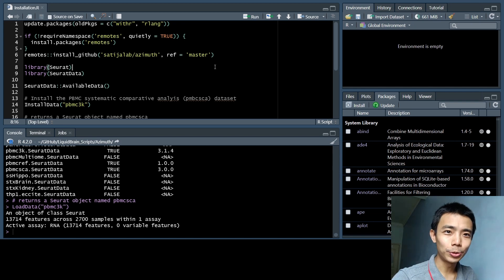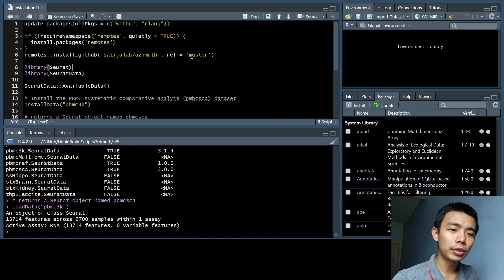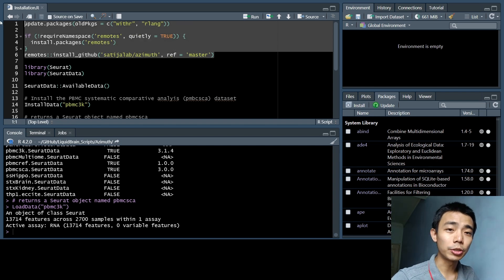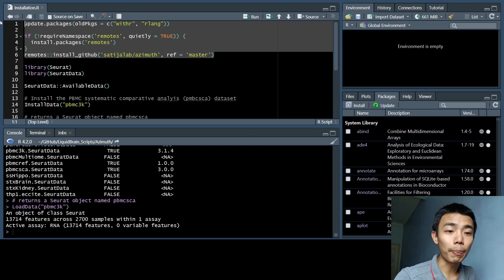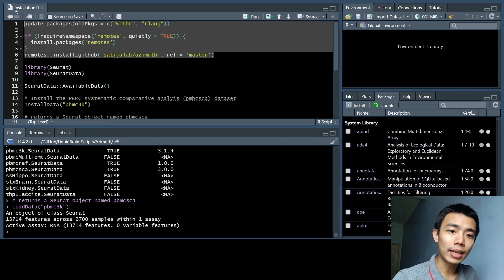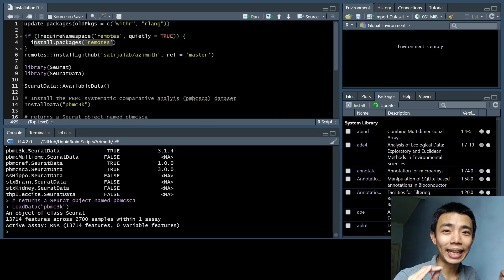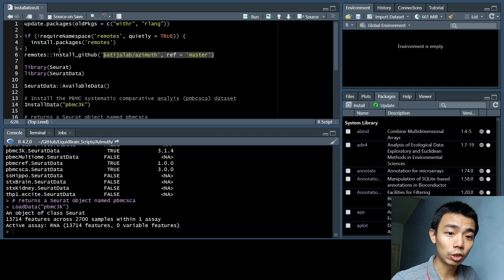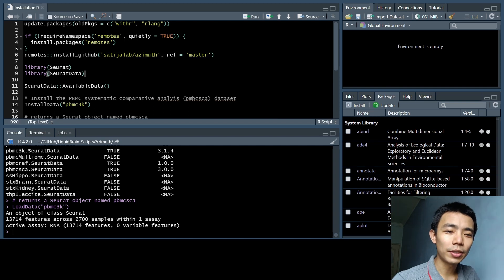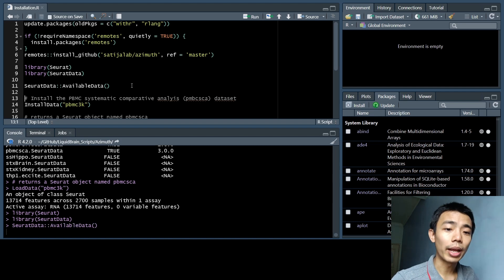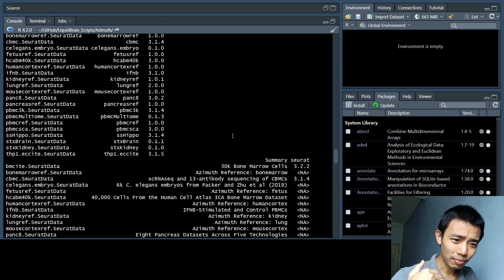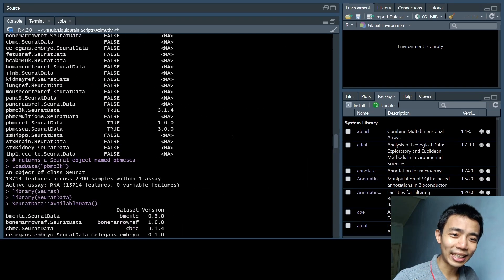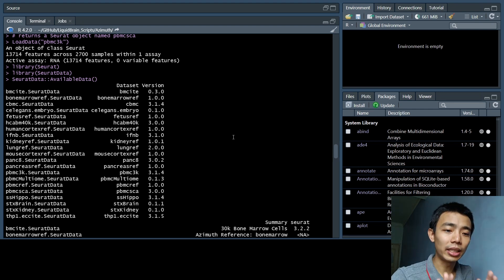Once you've done that, I also include a short script for you to install Azimuth as well as how you actually create a Seurat object to be uploaded onto the web app. For Azimuth, it's a bit more complicated because you actually have to update this tool package. And for the Windows user, you have to install something called Rtools because some of the packages need local compilation. After you've done that, you also have to install remotes because at this moment, Azimuth is not available in CRAN or Bioconductor. So you actually have to install it through the GitHub page with this command right here.